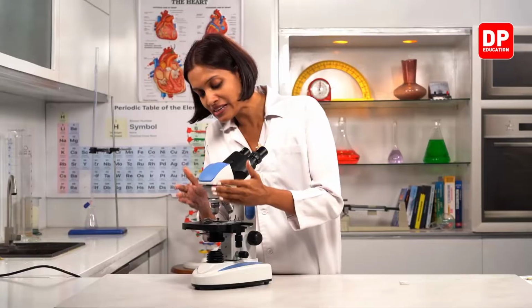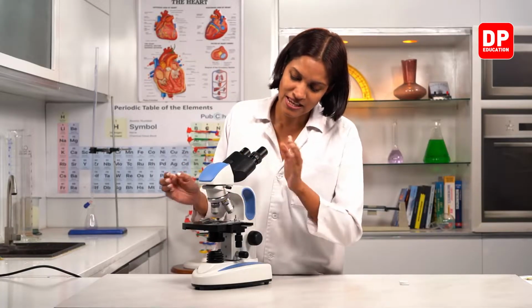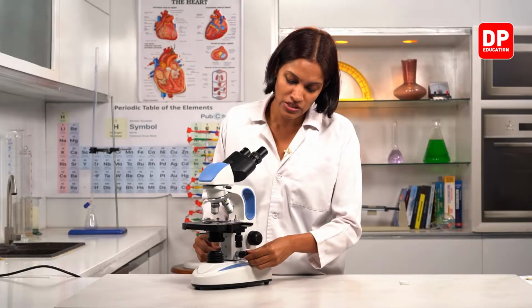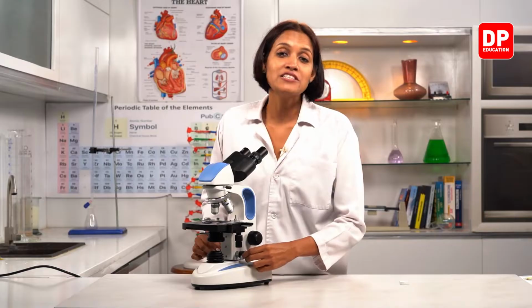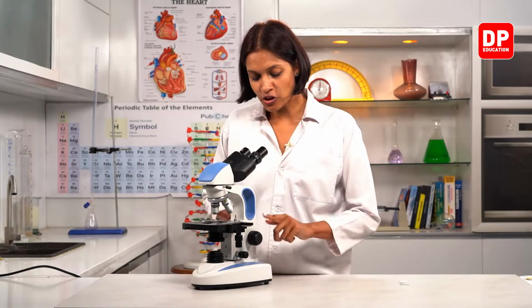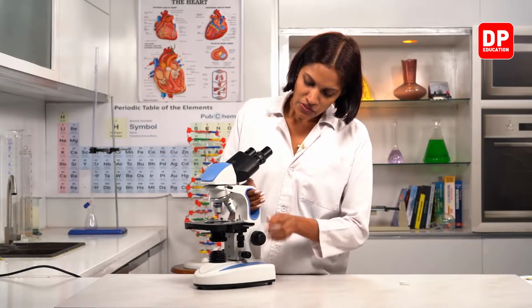Right? So for the final or the fine changing of the distance between the stage and the objective lens, we can use this smaller knob. This is known as fine adjustment knob. Right? Coarse adjustment knob, fine adjustment knob. Right, children?